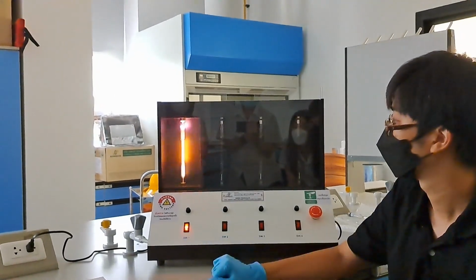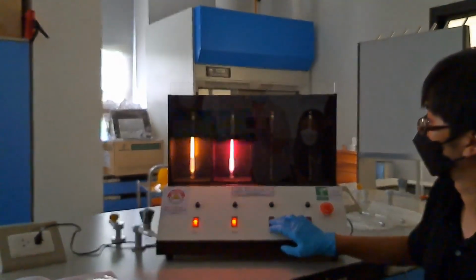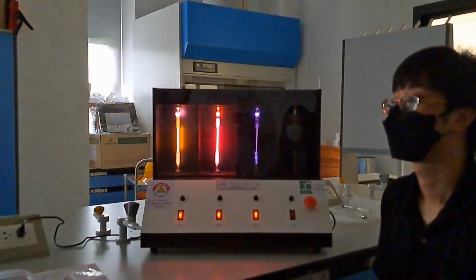This is helium, neon, and argon. Different gas gives off different color. It depends on the valence electron, the excited state, the ground state.